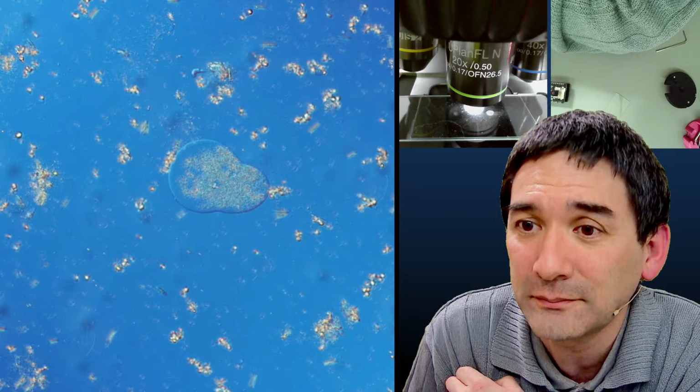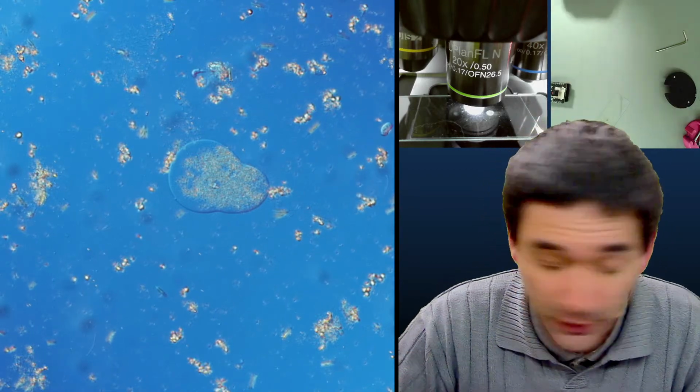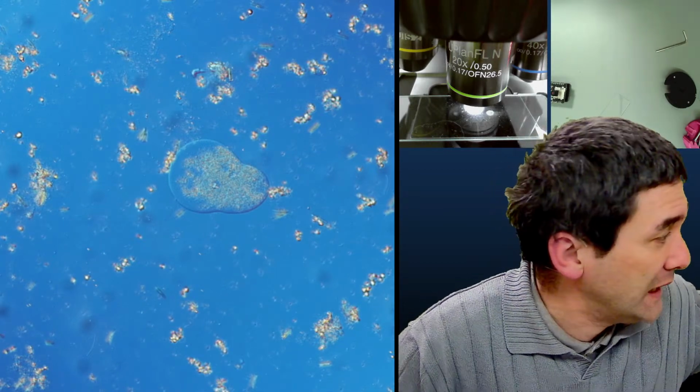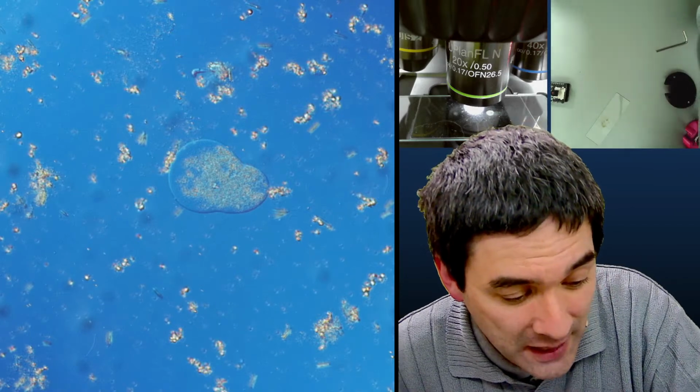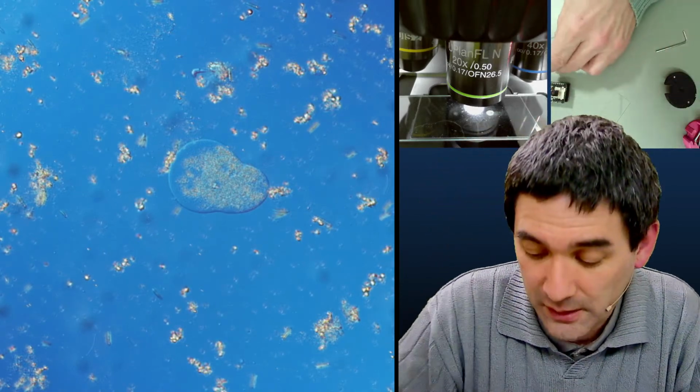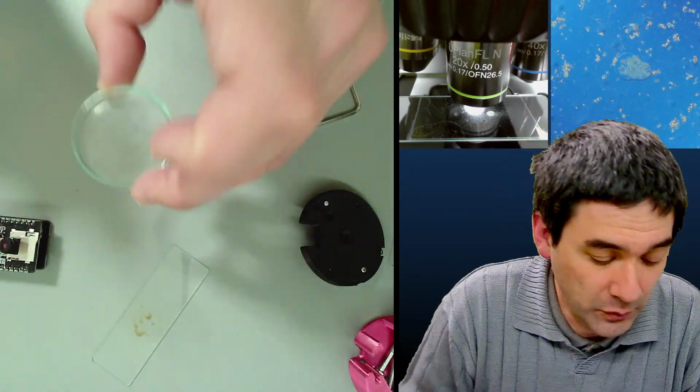Okay. This cell looks really squashed. And you know what I'm going to try now? Just for the fun of it, I'm going to add a little bit more water. I would like to see if I'm able to expand the cell again. Okay, so I'm going to show you what I'm doing here. I'm going to add a little bit of water.